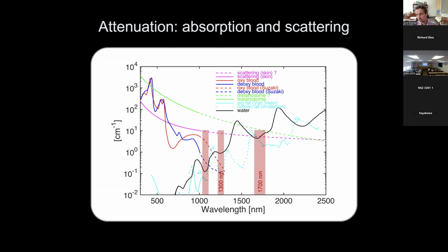Now, the nice thing about nonlinear optics is that we can use these very long wavelengths, use an optical nonlinearity, and then effectively excite chromophores that still have their absorption in the visible range of the spectrum. So that is therefore a very attractive strategy.